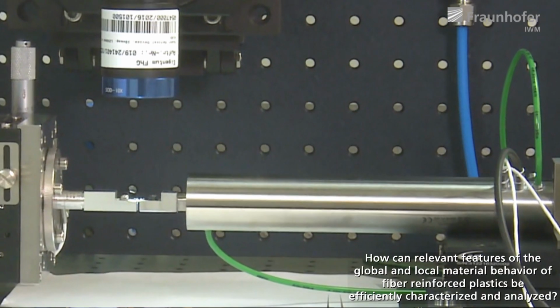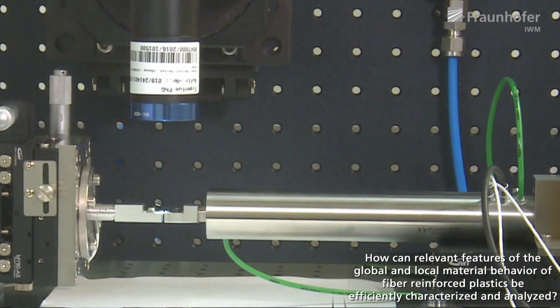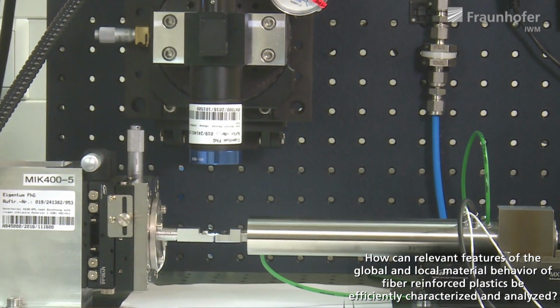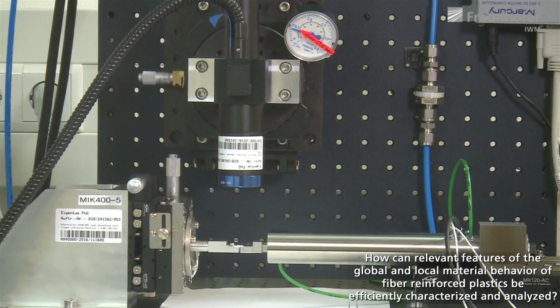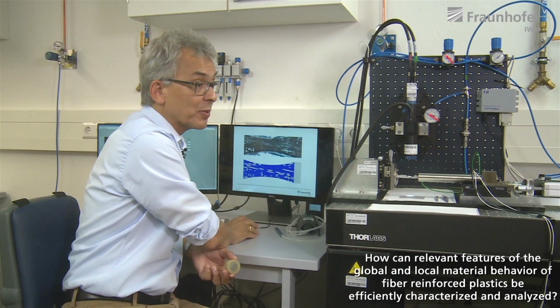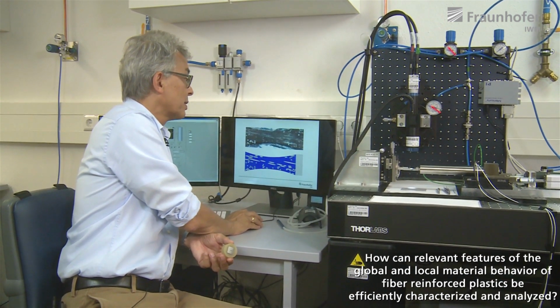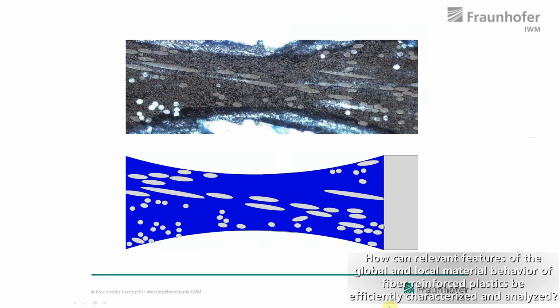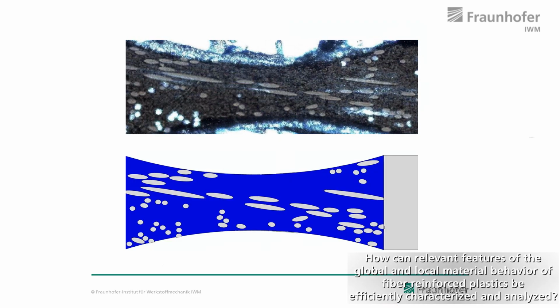During the loading, we again observe damage behavior and development via a video camera, and I'm going to show you right now what is to be seen if we observe the specimen itself, but also what we can do in simulation to describe the behavior numerically.